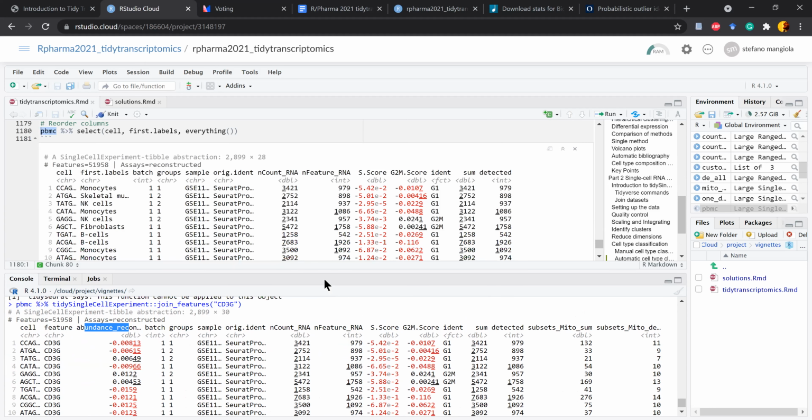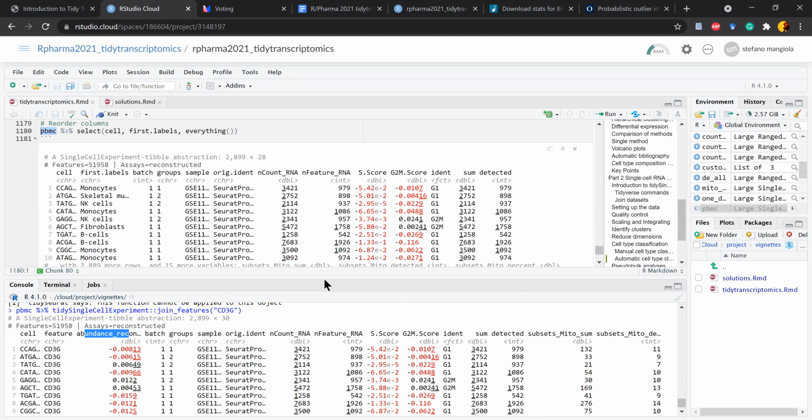On the other hand, because the data sets are smaller in size, for SummarizedExperiment, we visualize everything in the abstraction. And the other reason is that for single cell, the element we interact with more is the cell element, which is quite different from bulk data.